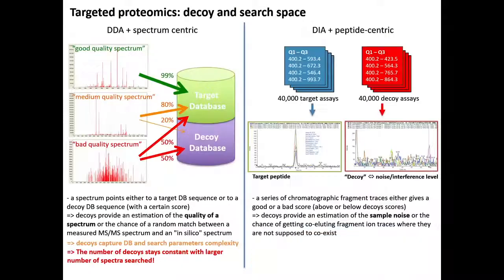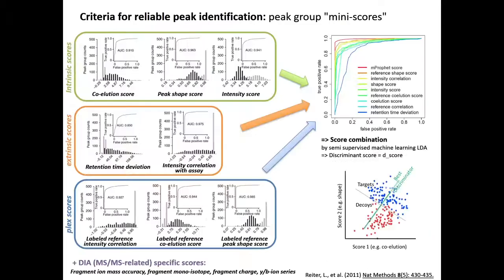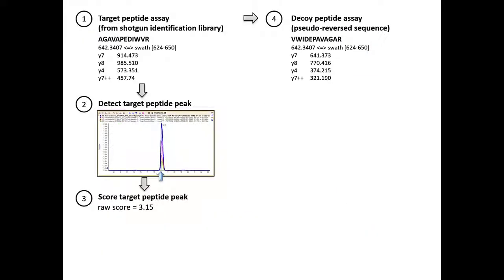The risk is that, by virtue of the amino acid sequence, the decoy captures, for example, the first four or five letters, and is actually capturing a mass because it's pseudo-palindromic from one side to the other, so you start to fall on top of the masses of the target peptides.